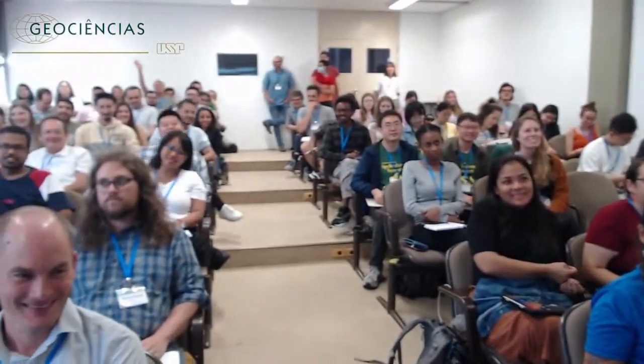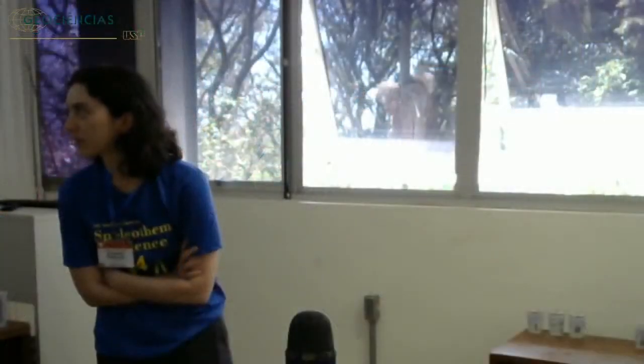Okay, yeah, we have a question in the back from Andrea. Can you hear him? I can't. Maybe repeat the question after he's done asking. Or Andrea, do you want to come to the front where the microphones are? Hi, Andreas. I don't think we've met in person, but I know of you. Yeah. So my question is about uranium leaching in dating. Do you have some experience or some tips for us to discriminate the potential leaching areas in speleothems, or do you just go for trial and error?